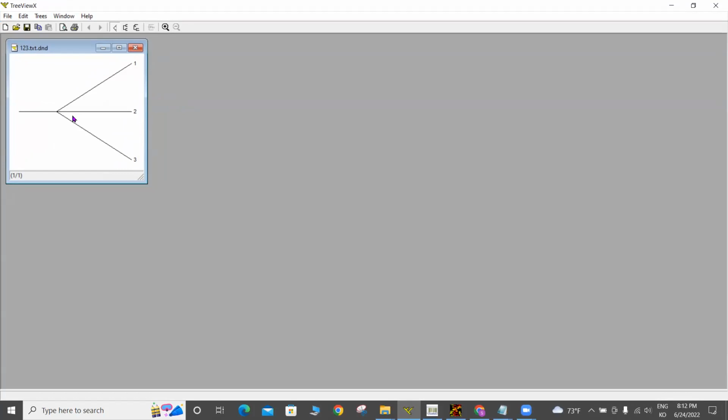That is an analysis of this phylogenetic tree. So it's a phylogenetic tree. 1, 2, and 3 are clades. So these 3 clades have a common ancestor. So if you are analyzing a lot of sequences, then you can get multiple clades here. Then you can analyze the result. So that's a basic thing. We are done with this thing.